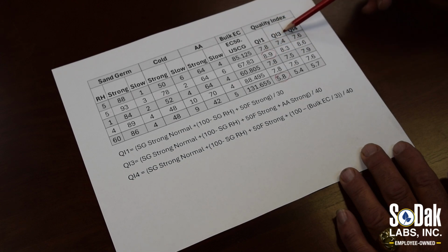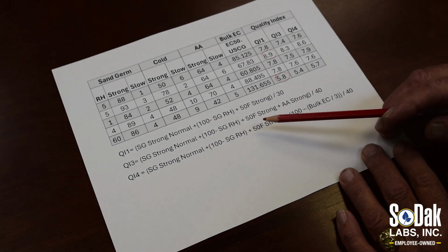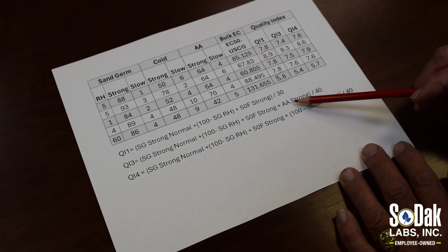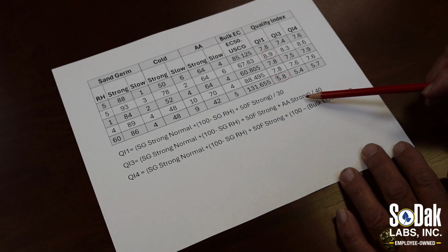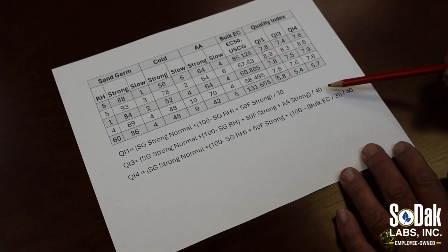When we go to the quality index 3, we keep the strong normals, we keep the rhizopus, we keep the 50 Fahrenheit strongs, but we add in the accelerated aging strongs. So we now have 4 response variables dividing by 40 for that 1 to 10 scale.